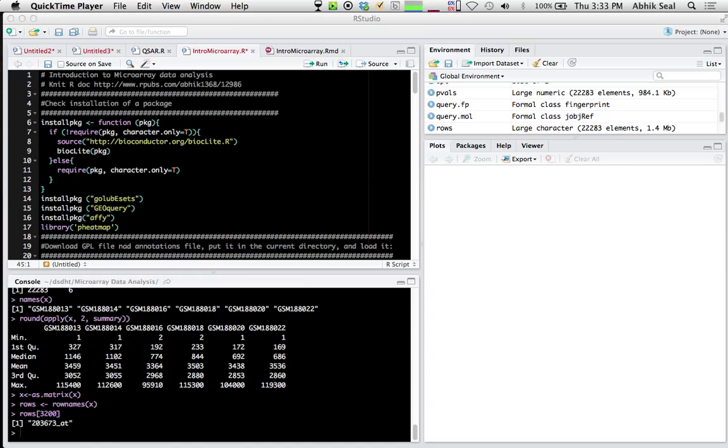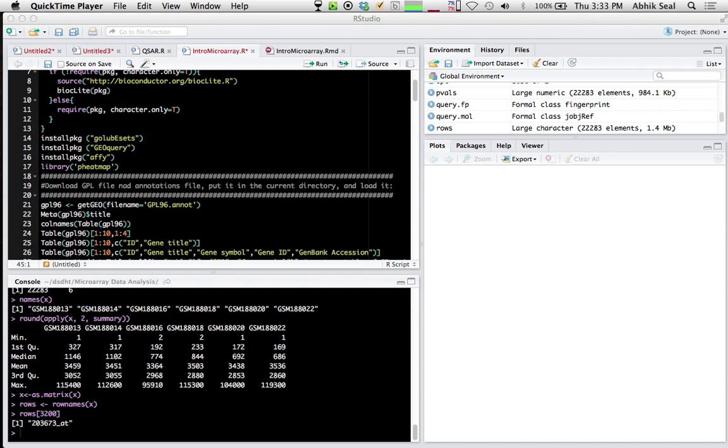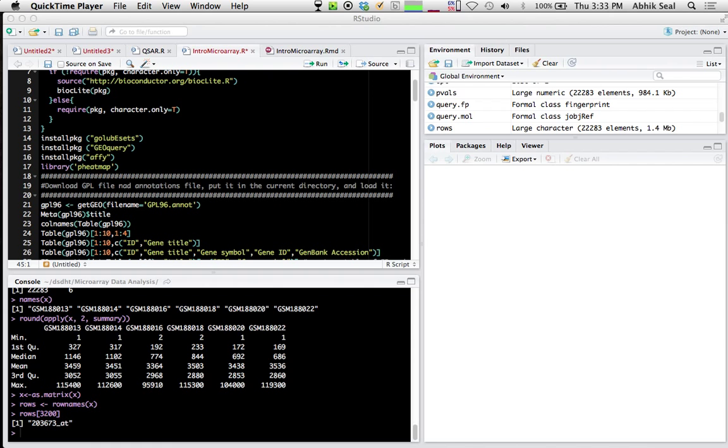The dataset is MCF breast cancer cells, available in GEO database GSE7765. I've used a subset of the data with 6 samples: 3 controls and 3 dioxin-treated samples.